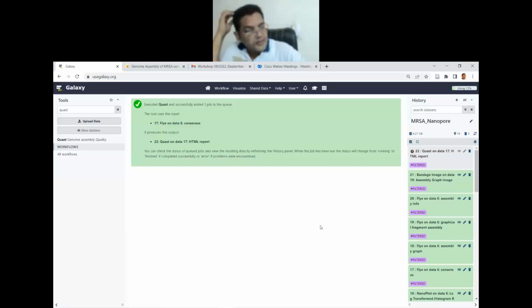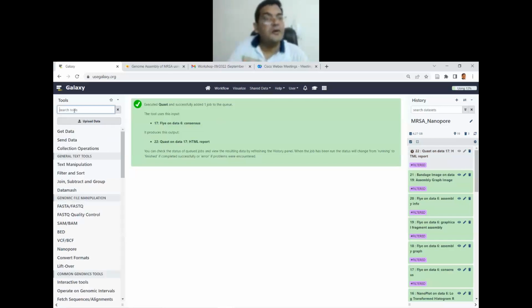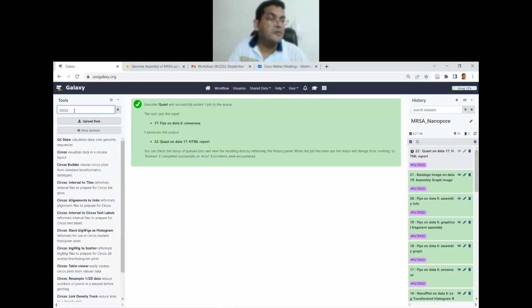Excuse me, sir. Yes. Can it draw a Circos also? Circos, you will have to see. Let me see if Circos is here. I'm sure it must be there. Yes, Circos is there. Can you see that? Yes. Okay, so it can do a Circos.